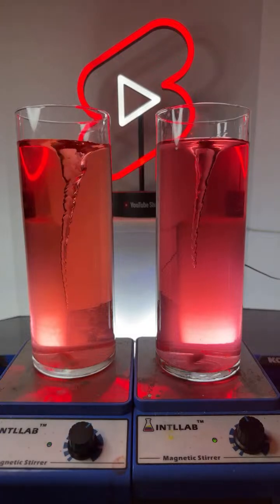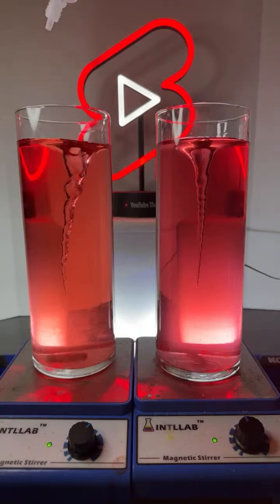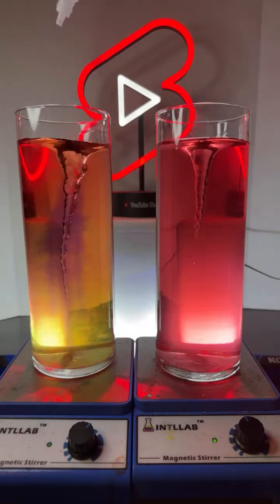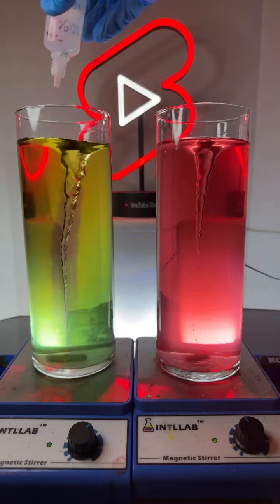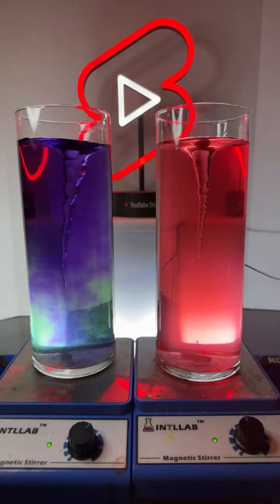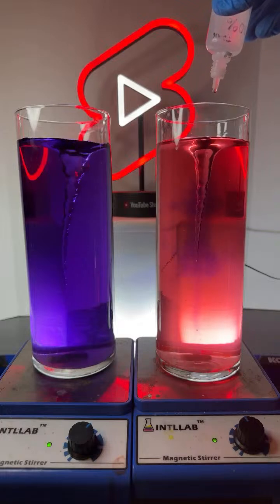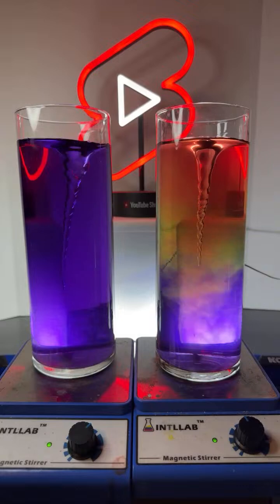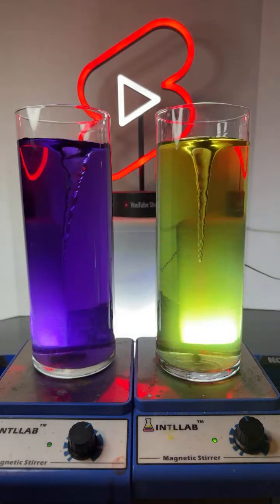All right, now I'm going to add sodium hydroxide base. Over here on the left. 1, 2, 3, 4, 5, 6. Kind of cool. Same over here on the right. What do you think? You think this setup's a little distracting? There, we got the rainbow. No, I think we're seeing okay. Looks like our pH is about 7 right now.